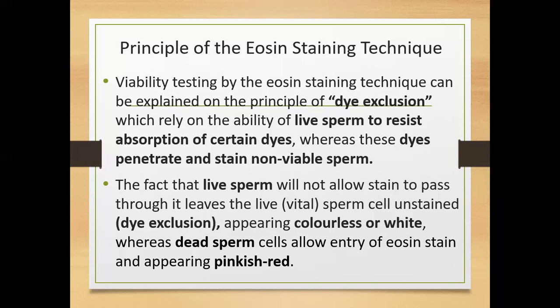Very good. Rhoda has given a good answer on the supravital stain. All right, so if the stain is going to be used in vitro, that is in the lab, you see that in radiology, sometimes they infuse certain dyes into the body, and the dyes color certain areas so that they can take the pictures there.